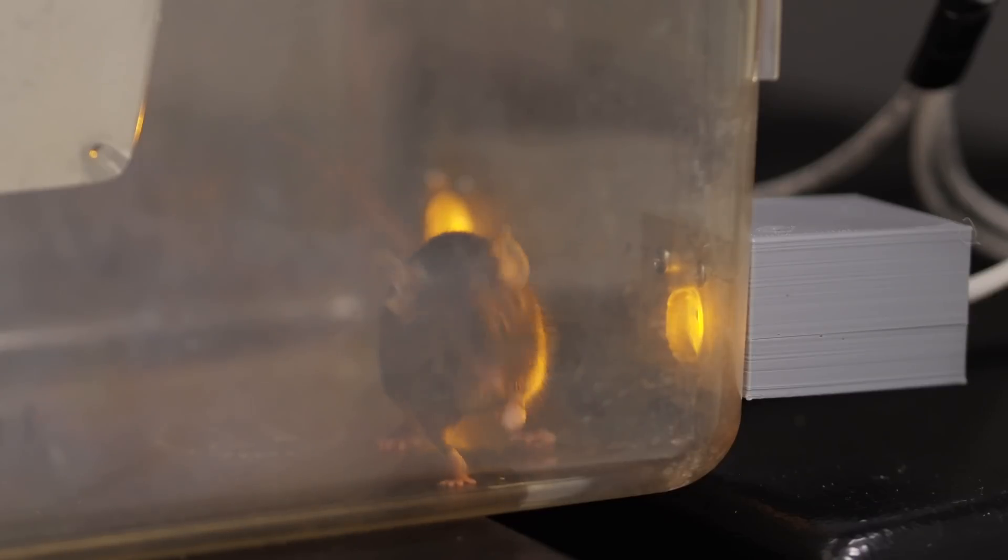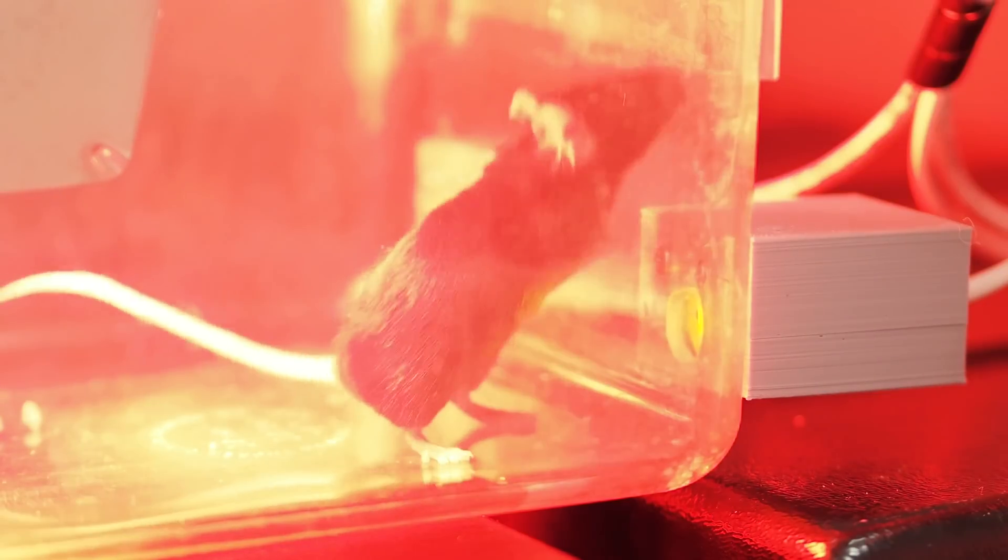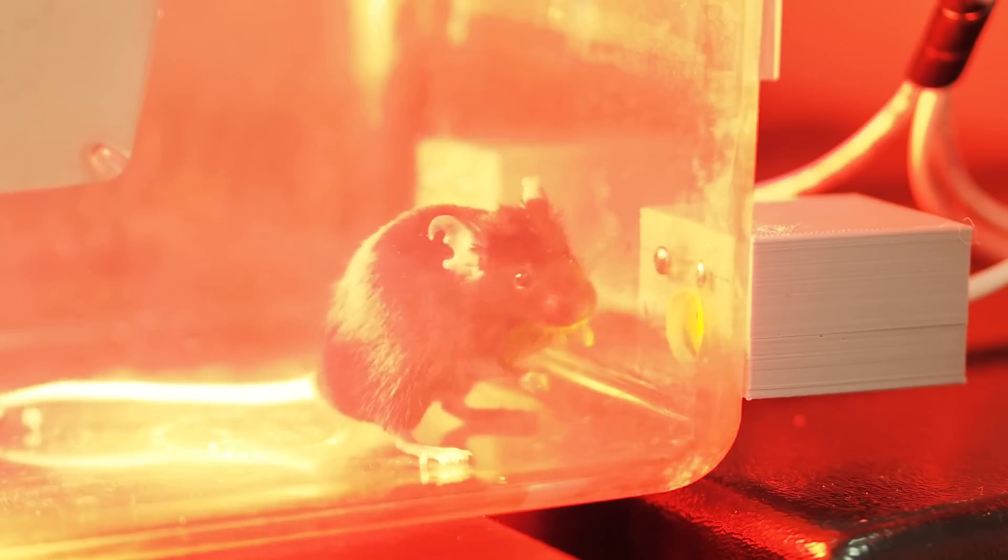And how does the nose poke come into play in that? So we can't talk to mice, unfortunately, and mice are the species we study. And so we have to design tests where they have to make a choice. And we compare their choices against statistical chance. And if they're choosing one thing more than the other, that suggests that they are choosing it for a reason. If we control the temperature, for example, and they're choosing to switch on a heat lamp, then they're able to sense the environmental temperature and they're able to respond to it.